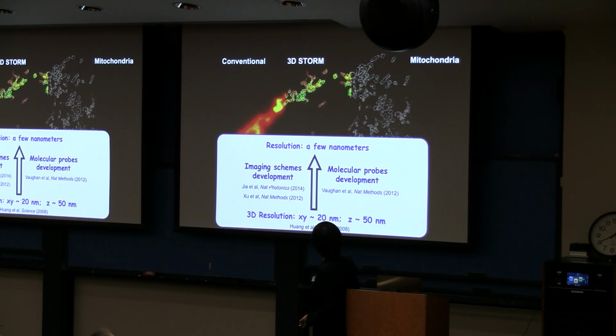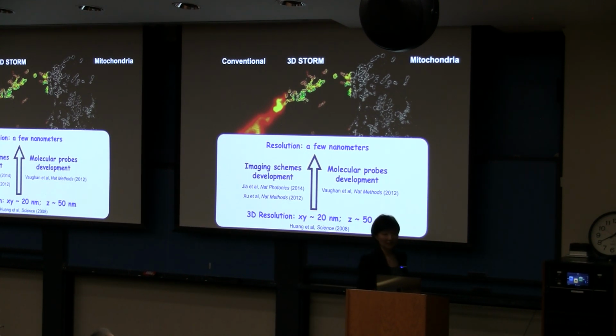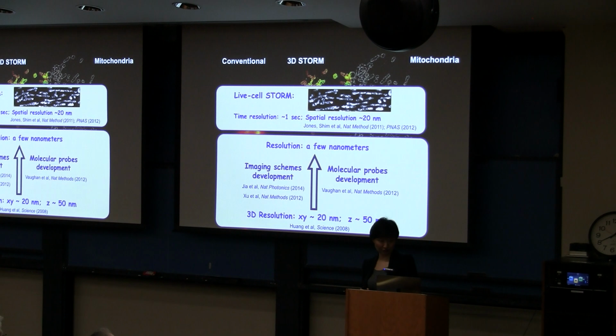I just list a subset of our work: you can improve the resolution either by developing new optical schemes or by advancing the molecular probes to make them emit more photons. With that, indeed, we can now have a few nanometer resolution, which is truly at the molecular scale.